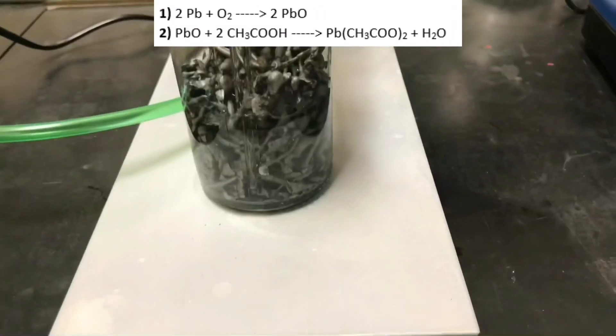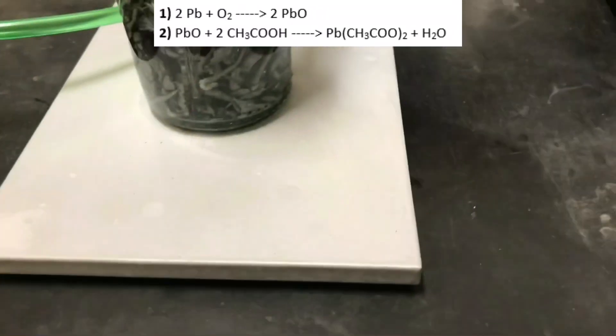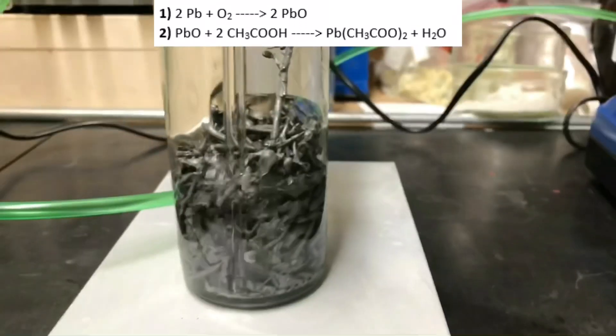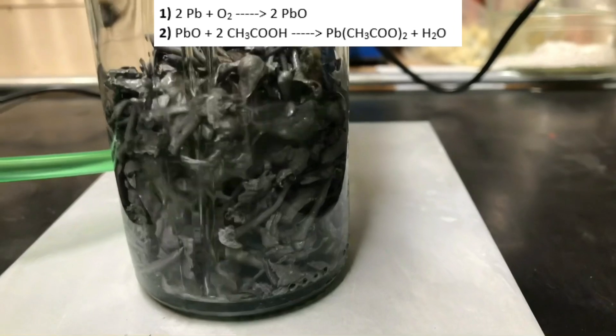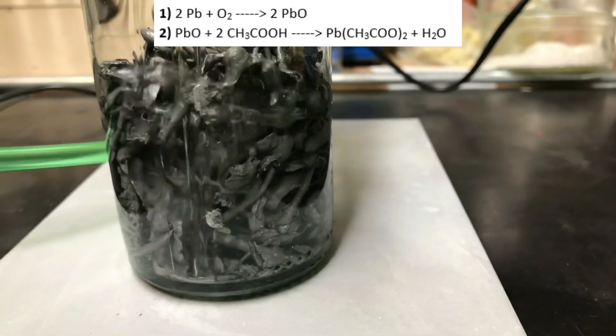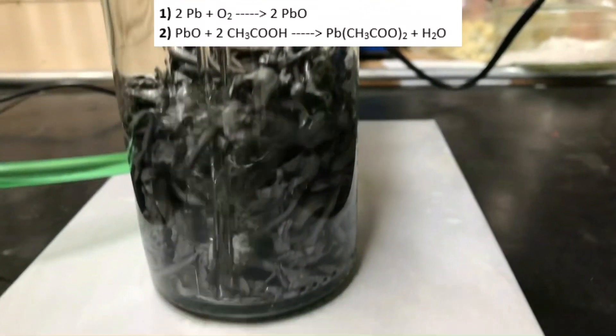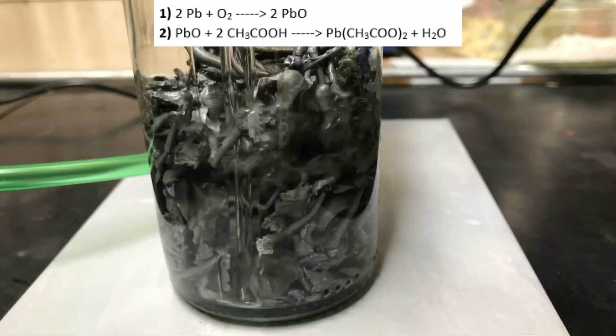The lead metal wouldn't react with the acetic acid on its own, but by bubbling oxygen through the lead, it is first oxidized to lead(II) oxide. The lead(II) oxide then reacts with the acetic acid to form water-soluble lead(II) acetate. This process takes a long time, but it works.